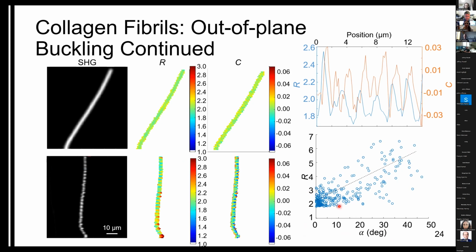As I mentioned before, when the C value was first looked at, they needed to cut pig tendon at several different angles to find its molecular value. Here in this experiment, we don't need to do any cutting, and we can figure out the molecular values straight from using these collagen fibrils.